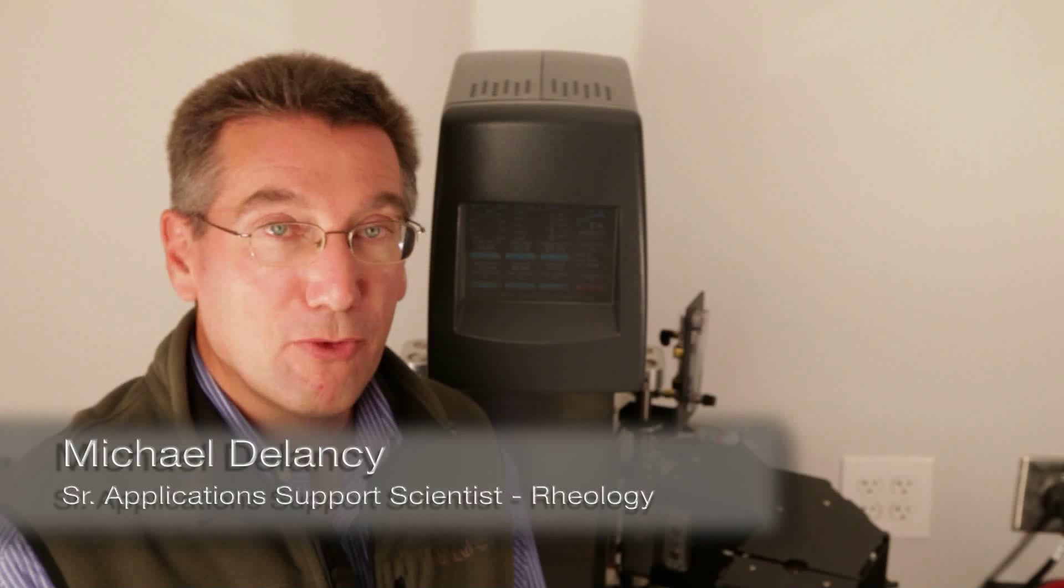This TA Tech Tip will guide you through the process of how to perform the torque and normal force calibrations for the ARIES G2 rheometers.